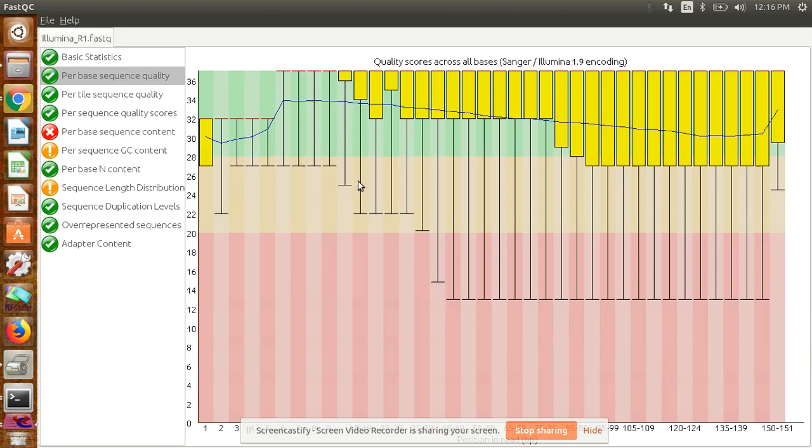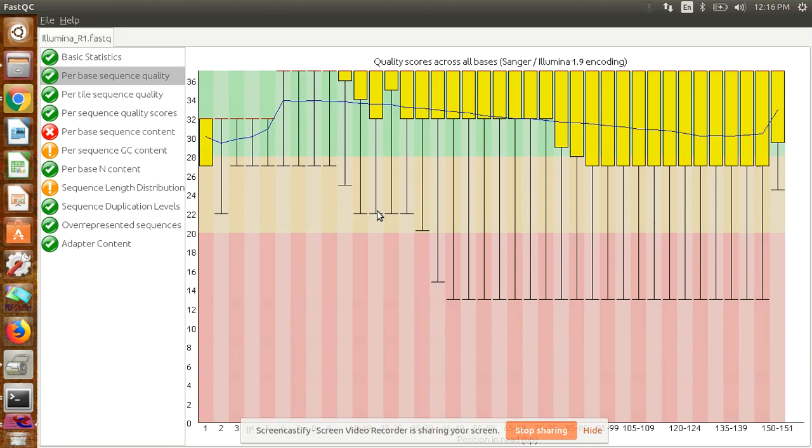This is the basic factor you can check for raw sequence quality. This video may be helpful to you. If you have any question, you can ask me. We'll come later on with details of this discussion. This is my first video I'm putting on YouTube.